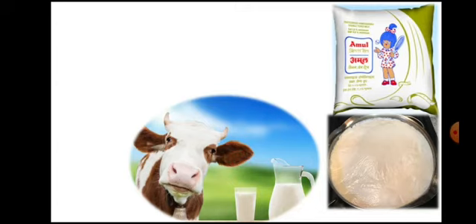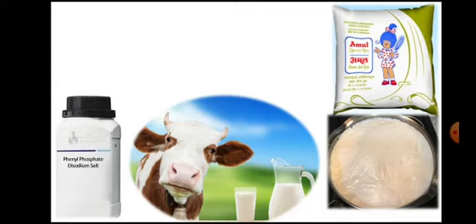This is for positive control. Then you will have a test milk sample. So in all, how many milk samples do you have? Pasteurized milk or boiled milk for the preparation of negative control, raw milk for the preparation of positive control, and test milk sample.